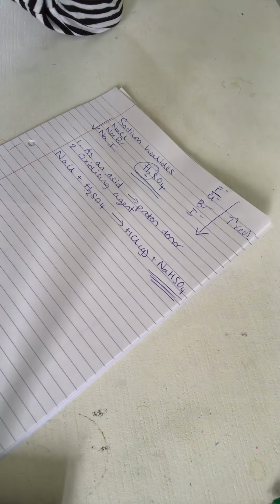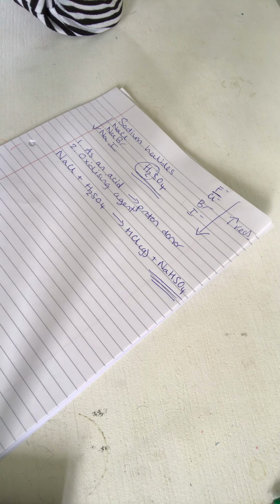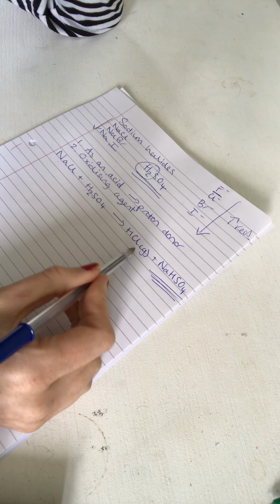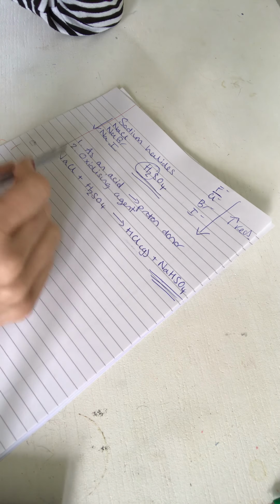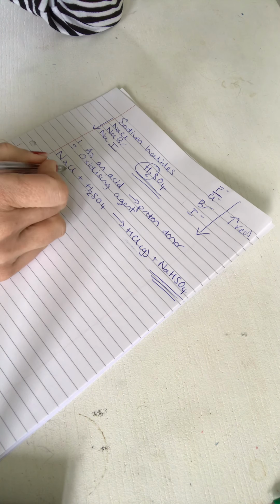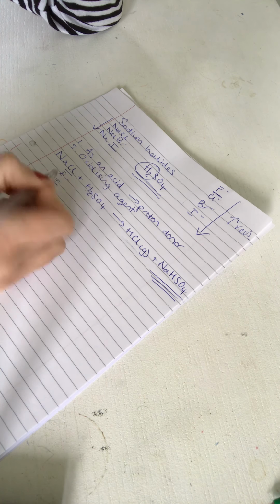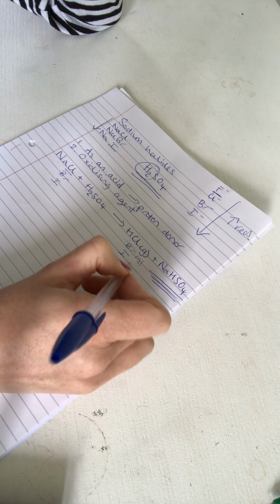Now, you will always get that with any of these sodium halides. The only thing that differs is the hydrogen halide gas that you get. So you'll have the same reaction for all three, you just need to change that for either Br or I, and they are all gases.